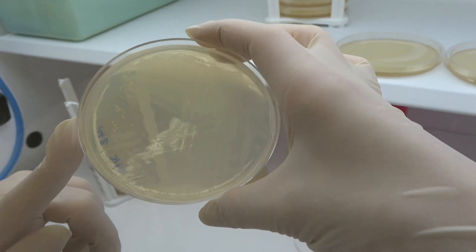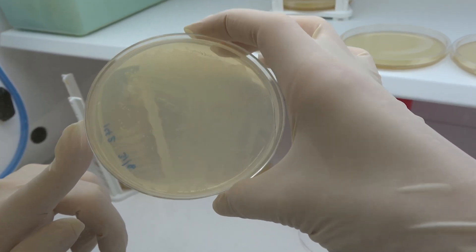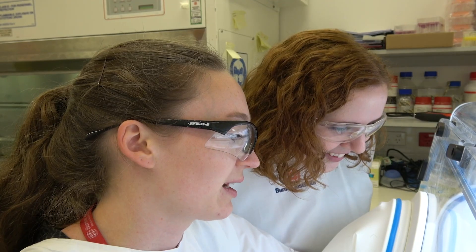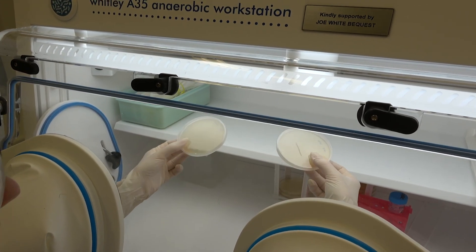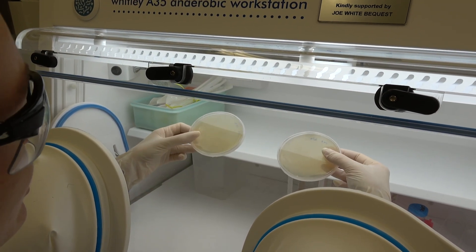We also use the chamber to grow bacteria isolated from women in South Africa, so that we can test whether those bacteria are killed by our vaginal metabolite, which is a potential drug — lactic acid. We can grow these bacteria and see whether they can grow in the presence of lactic acid.